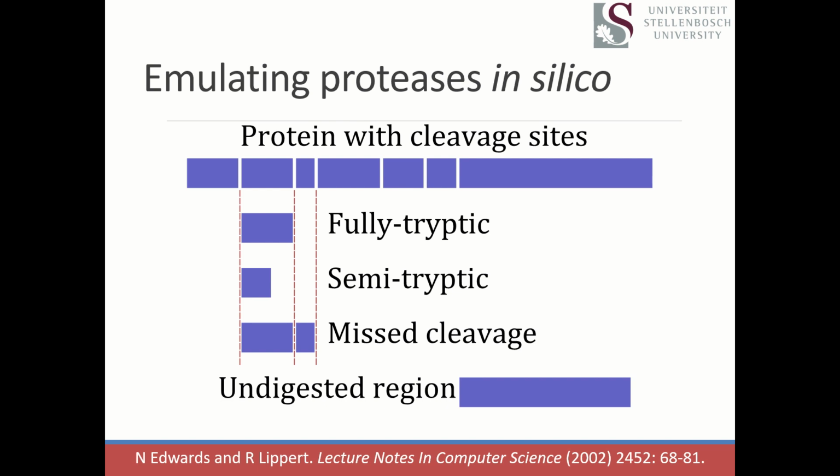Finally, there are frequently some very large regions of proteins that we fail to identify peptides from. Imagine a transmembrane domain of a protein. What is the nature of amino acids used in transmembrane domains? Anyone know? What's their dominant characteristic, their chemical phenomenon called hydrophobicity? Hydrophobicity. If you have a protein that's passing through a membrane, it's passing through a very hydrophobic region.